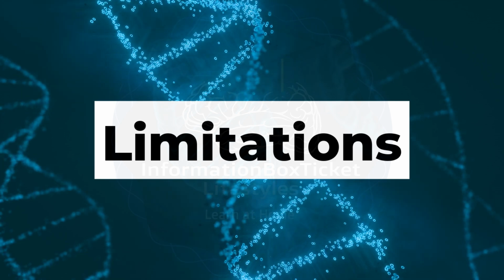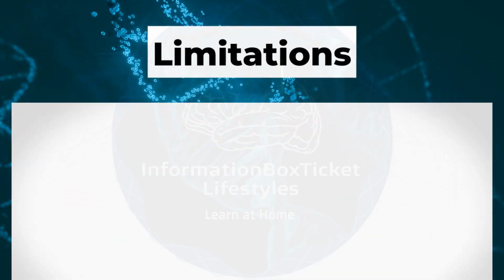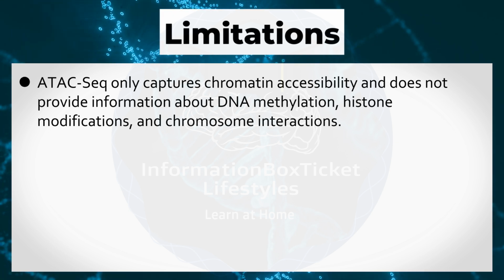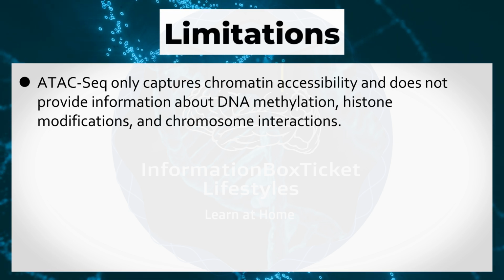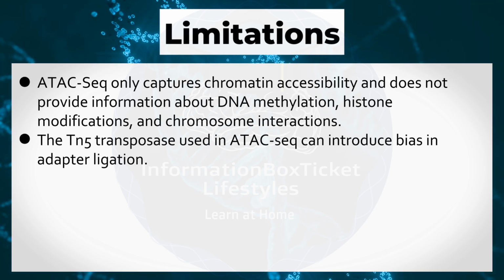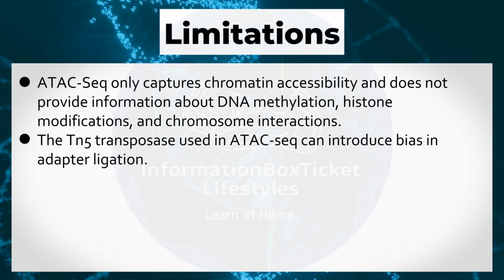Limitations of ATAC-Seq. ATAC-Seq only captures chromatin accessibility and does not provide information about DNA methylation, histone modifications, and chromosome interactions. The Tn5 transposase used in ATAC-Seq can introduce bias in adapter ligation.